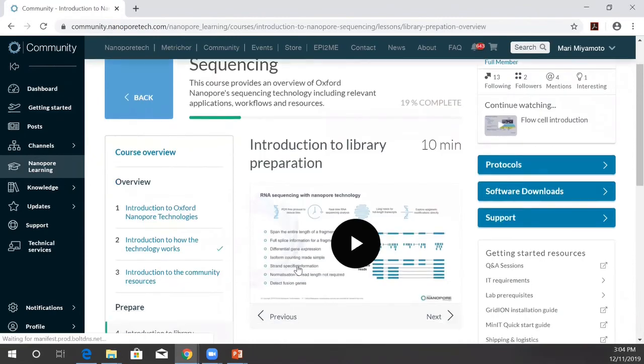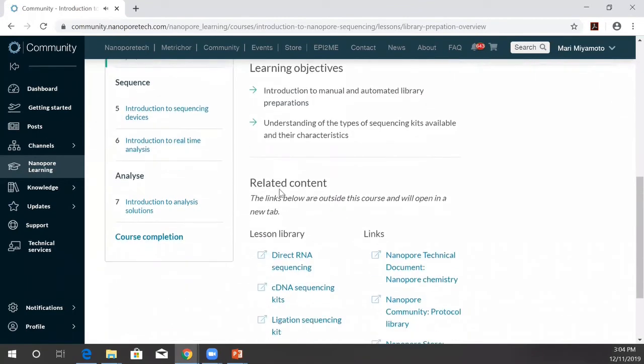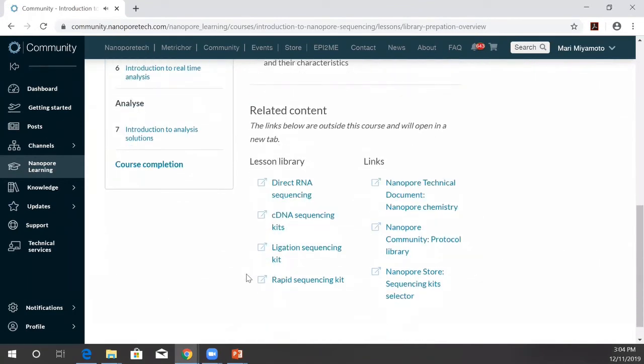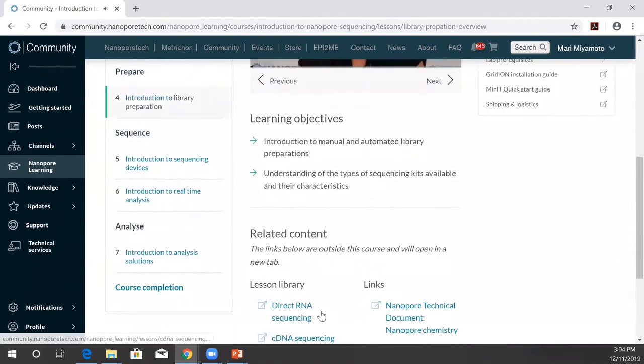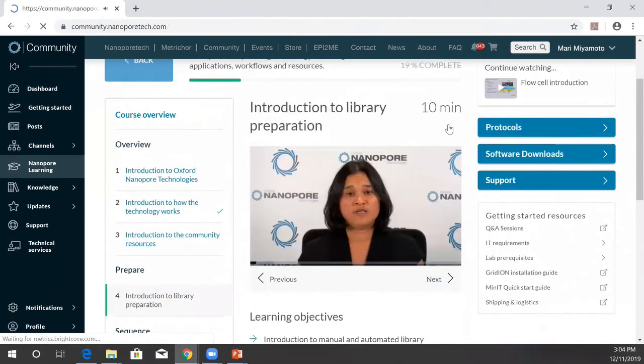Our technical service member is telling you what library preparation you have to do. Hello, I'm Hazel Johnson, and I'm a Technical Services Specialist at Oxford Nanopore Technologies. In this video, I'll be taking you through an overview of the various options available to prepare your library ready for sequencing. And also the variety of protocols available from here.